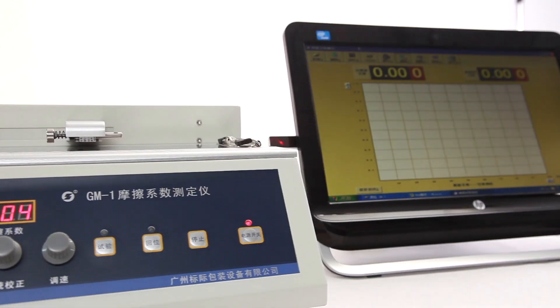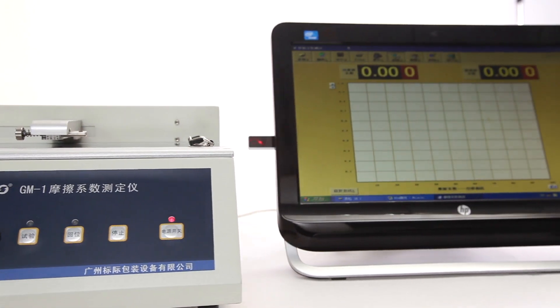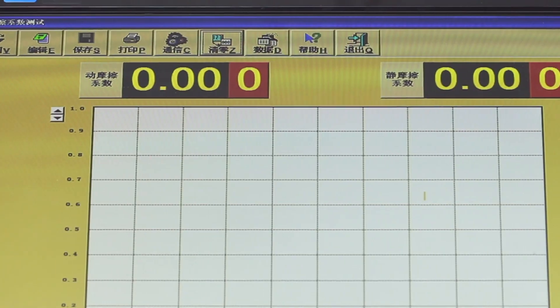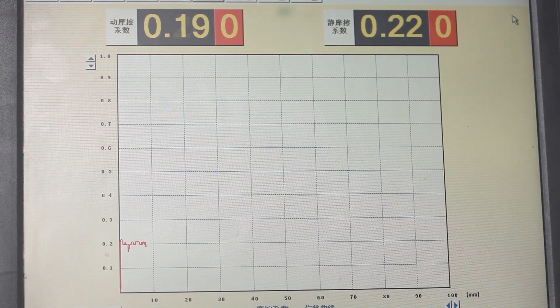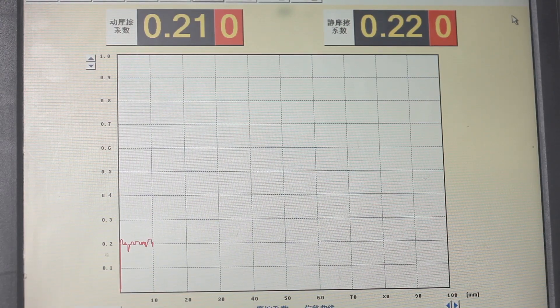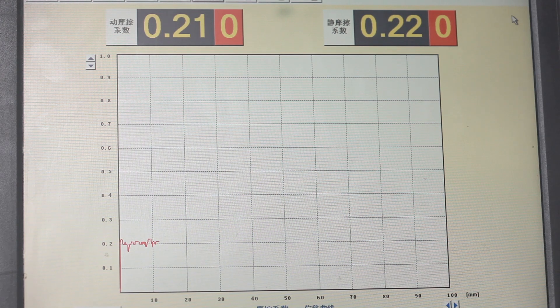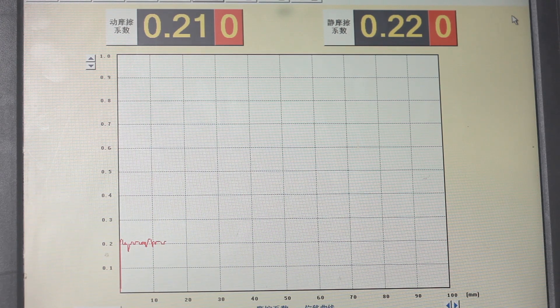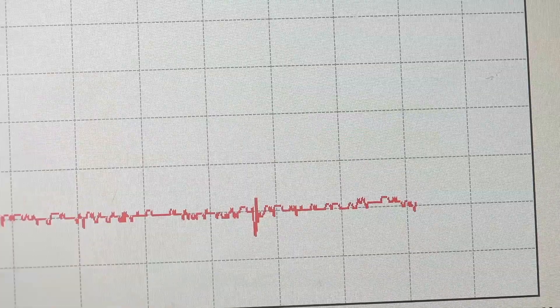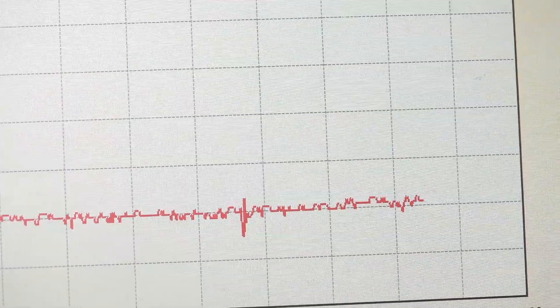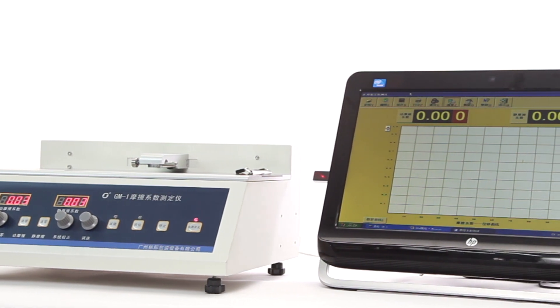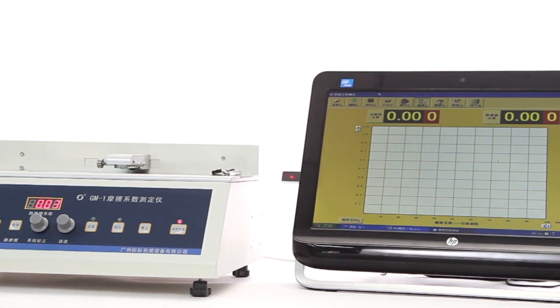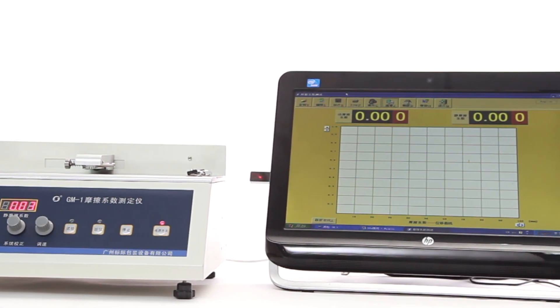GM1 has professional software that can display in real-time 450 records of static and kinetic coefficient of friction data and curves during the test process, and can create and print reports and curves by computer.